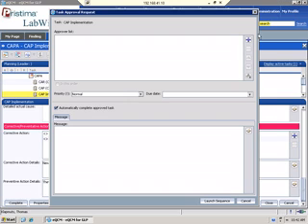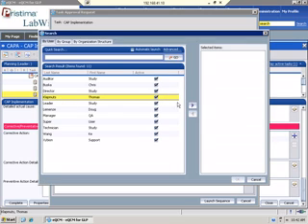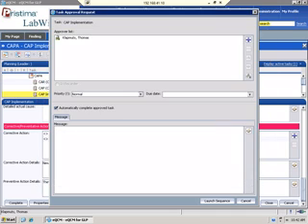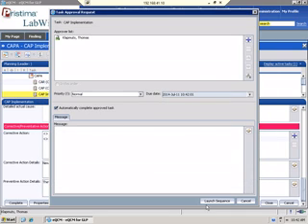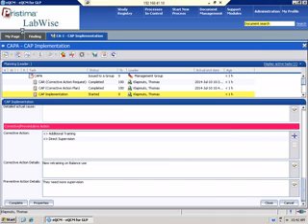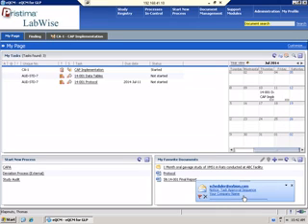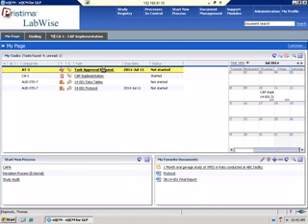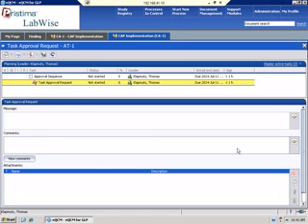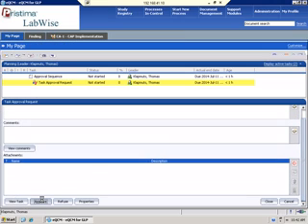So again, when I mark it complete, it's going to send it for approval. Go to the manager. Again, you can define the work process, the due date, a message. That person, again, will get the email notification. You can click on it and log in, or when you log back into the system, you see you have a task waiting to be approved. So here I can go through it, I can view the task again, and I can approve the task.